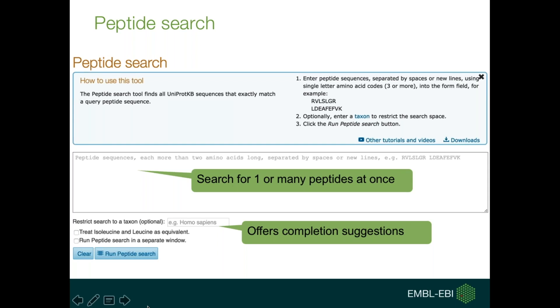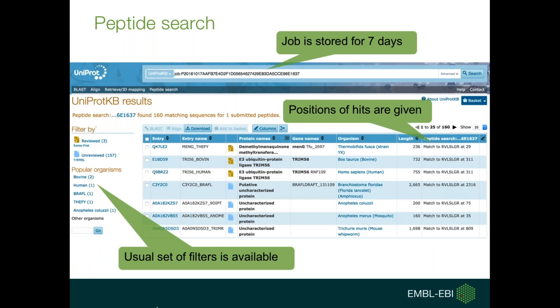The interface looks like this. It's fairly straightforward. You have a box where you input all the peptides you're interested in, one per line. You can search for more than one peptide. Please note that all the peptides are evaluated individually, which means that if peptide 1 generates 150 hits and peptide 2 generates 200 hits, you will get 350 hits if there are no overlaps. Obviously, several peptides can match to the same sequence. The taxon search box offers completion suggestions, so if you start typing 'mouse' it will offer completions for that species or other species within that genus.